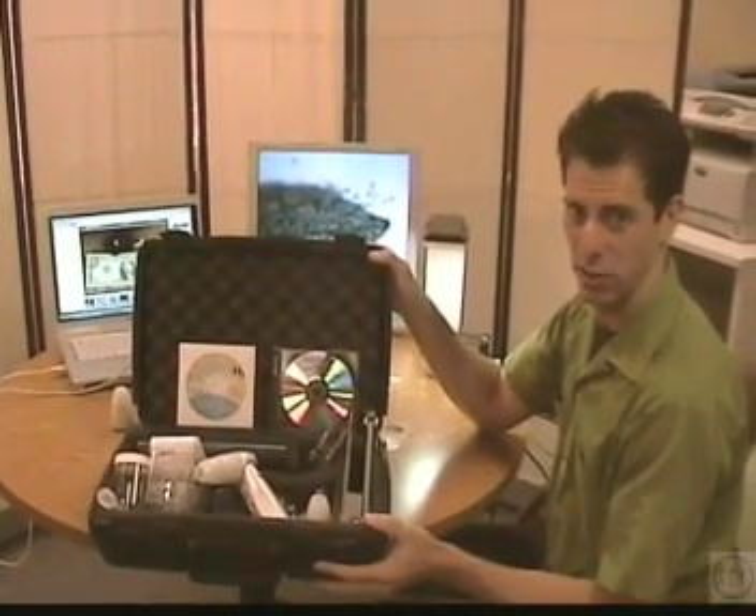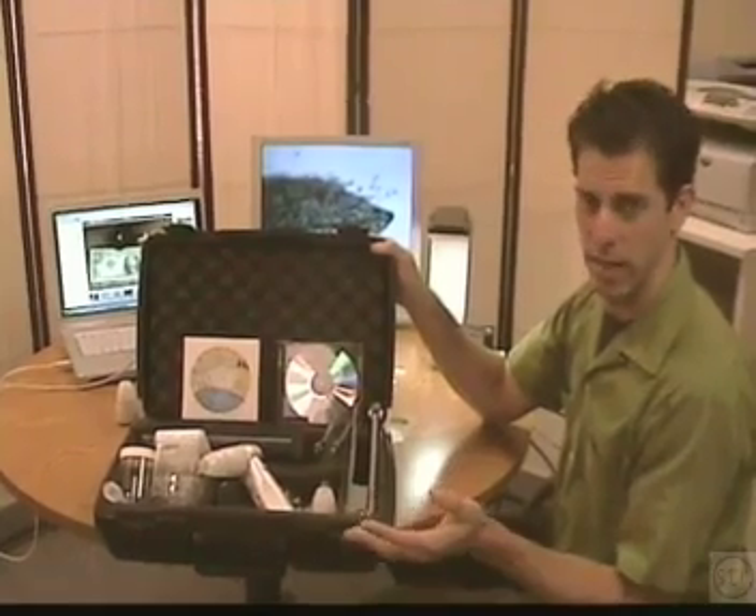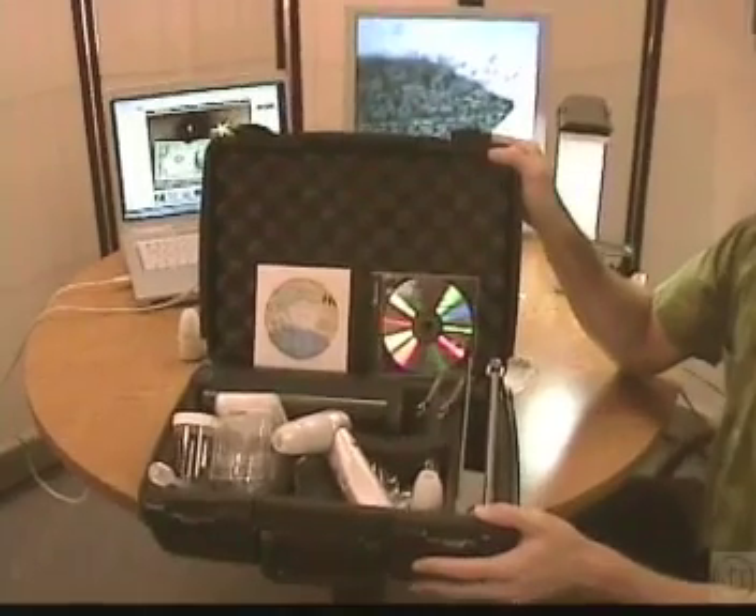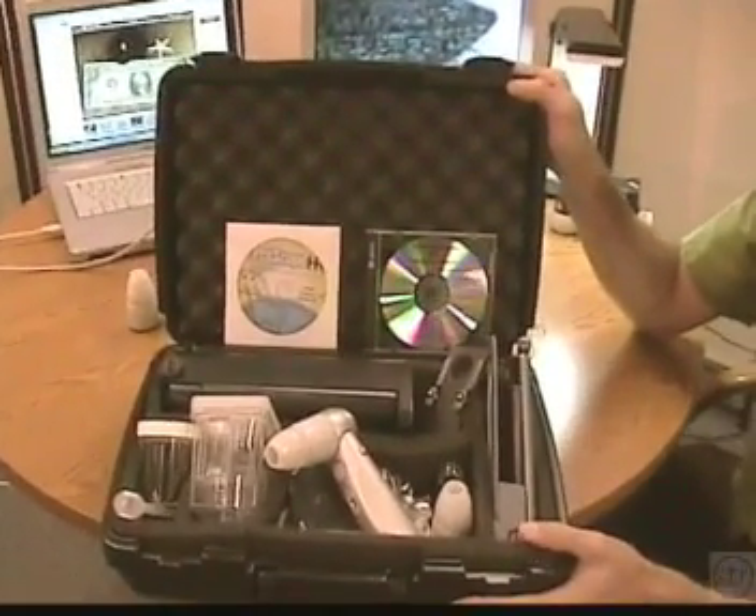Hi, I'm Mark Hoffman with STR, School Technology Resources. In this video we're going to take a look at the ProScope HR and the Scope on a Rope L2 camera. This is one of our exclusive education kits available from STR.